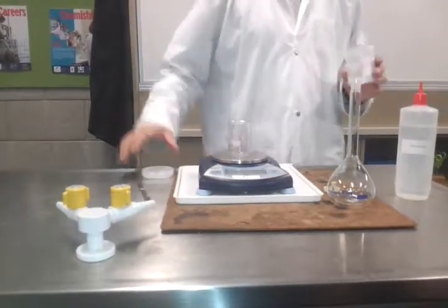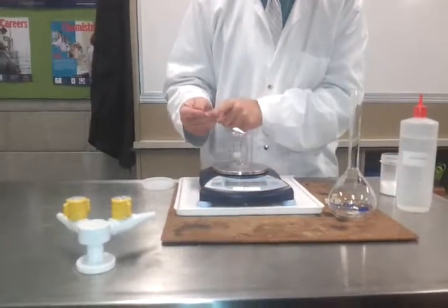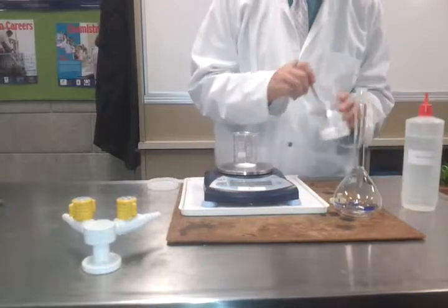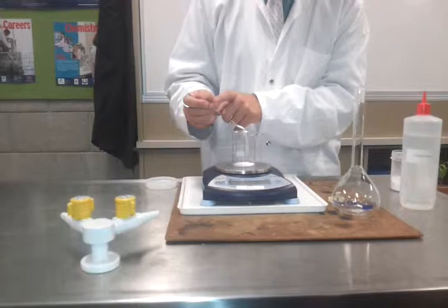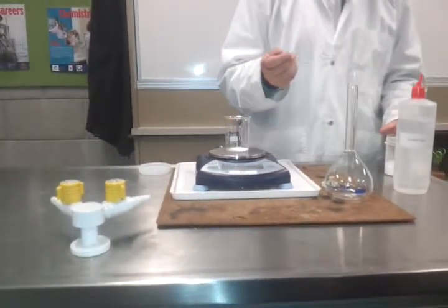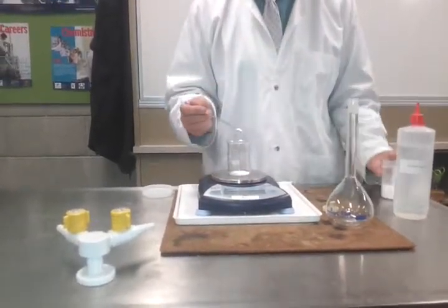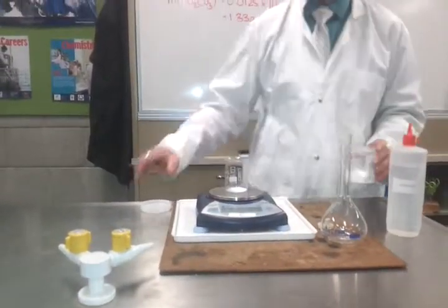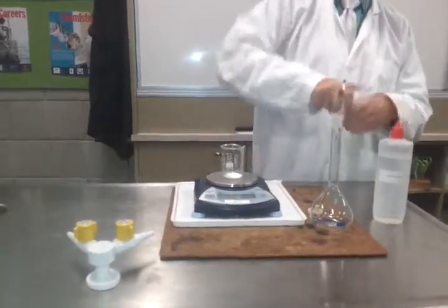And I want 1.33, but that's really hard to get. So I'm just going to go until I get about 1.3. It's a fair bit. That's halfway. And whoops, I'm only at 1.31. I'm actually going to go a little bit more because I want to show you how to do it if you go over. So I've got 1.48, which is too much, but that's okay. I'm not going to worry about that.